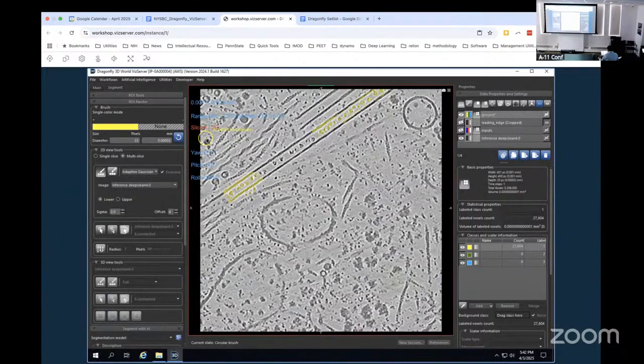The reason why you can't click on it in Dragonfly is that if you don't have something selected that it can manipulate with that tool, it won't let you pick the tool. Now, it's kind of nice because then you know you can't use it, but also annoying. So if you select the multi-ROI or what I call the inputs in the saved data, either one of these, it should then allow you to actually select. Actually, you select your ground, then you select this. Yeah. Okay.